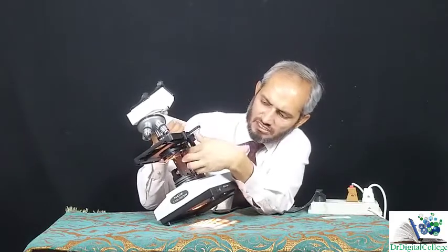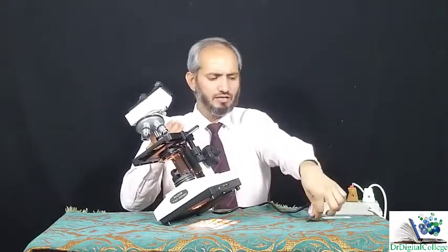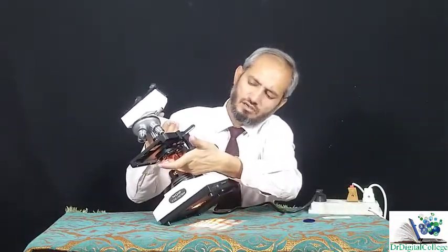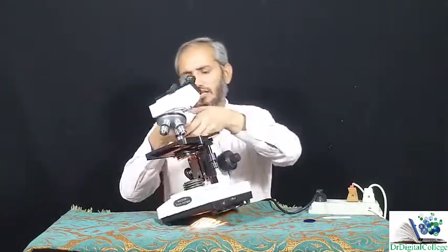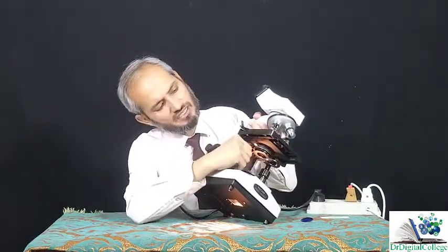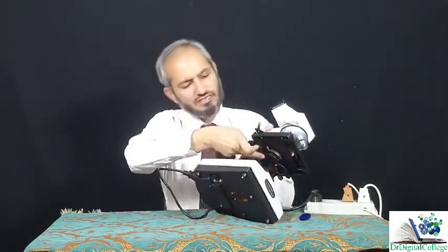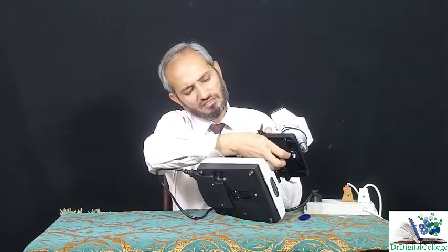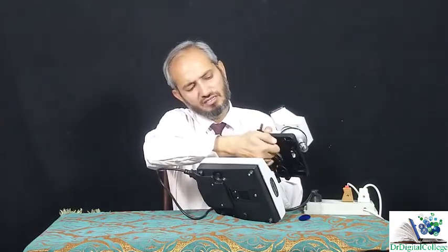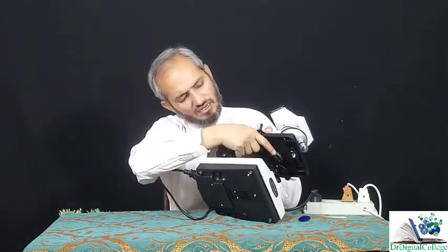Now, another thing is, if I am removing it for the time being, if I am keeping it here, this is the aperture of the light. Here I am putting my finger, this is the aperture, and this aperture can be changed by this small knob. If you can observe from here, the aperture is being changed. Say for example, if I am putting my finger over here, this is a very small aperture. This is the smallest aperture, this is the largest aperture. It means the aperture is moving like this.